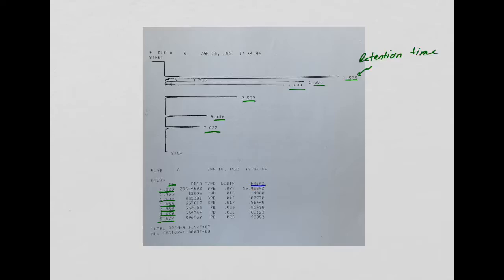Based on this, 95% of it is this compound. What is that compound? That is most likely my solvent, because again, the majority of the sample that you inject is the solvent. And we said you will get a peak for the solvent. And it's usually the one with the biggest and largest area percent. So that is my solvent peak.